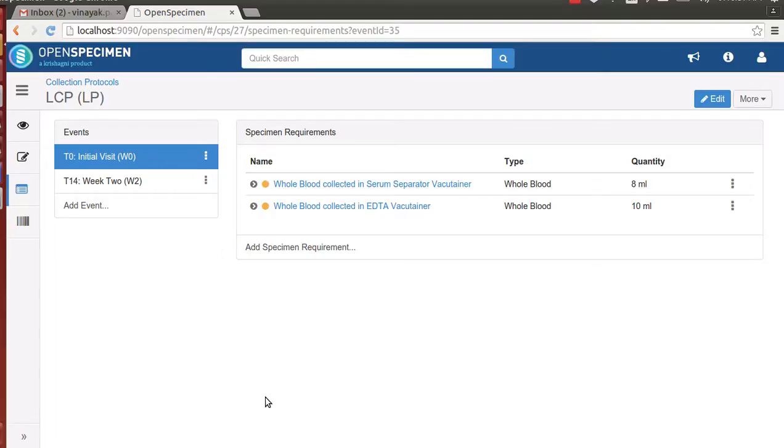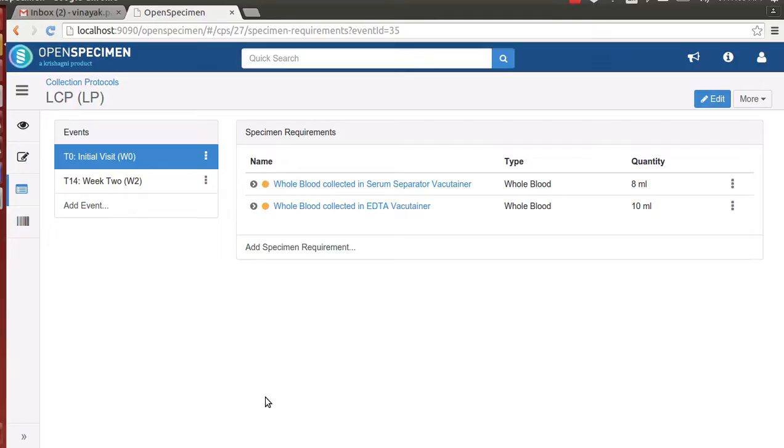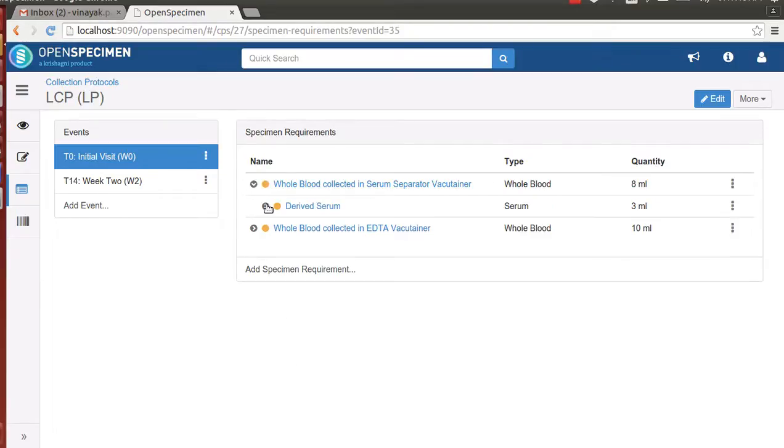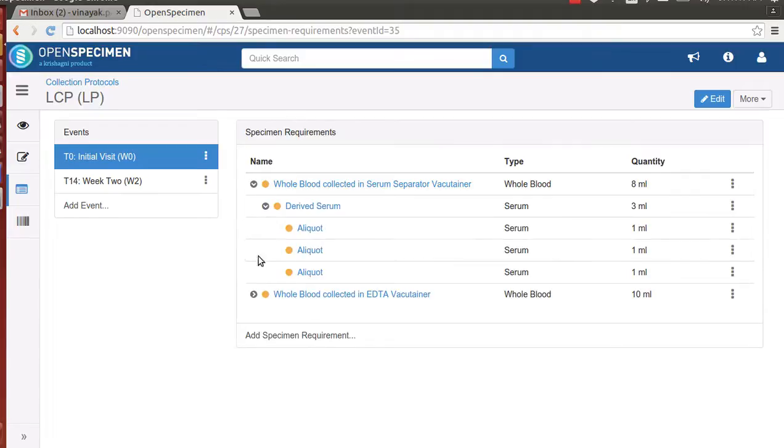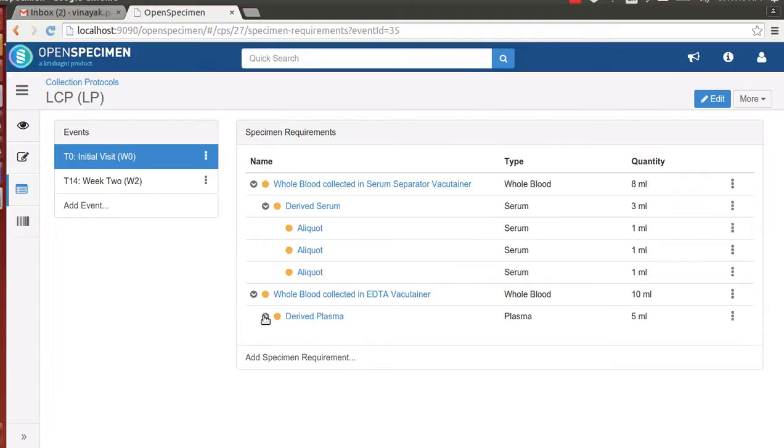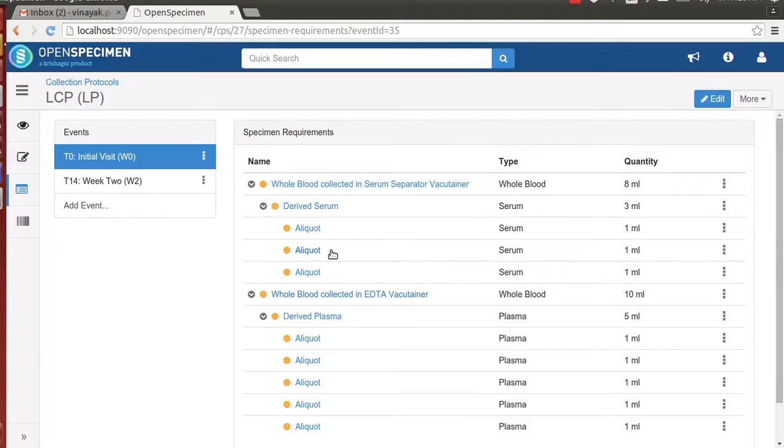Each of these events are identified by a short code W0 and W2 respectively. The initial visit event is made up of two primary specimens: whole blood in serum separated vacutainer and whole blood in EDTA vacutainer. Each of these primary specimens have aliquots as can be seen on the screen. We have three serum aliquots and five plasma aliquots.